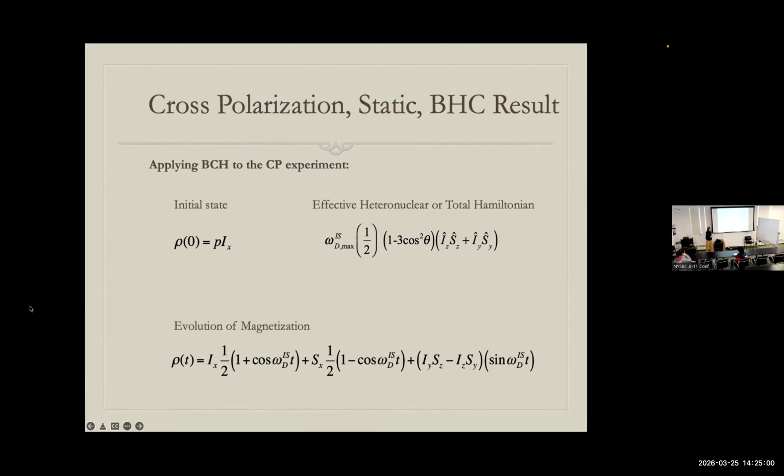You begin on whatever you were on, and then sinusoidally, you develop some SX. So that's your protons, and that's your carbon. One more term here is funny.